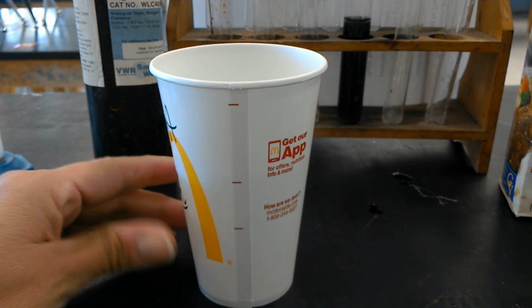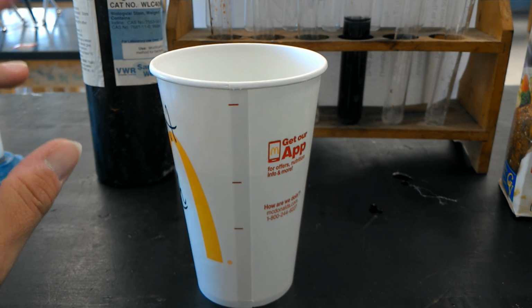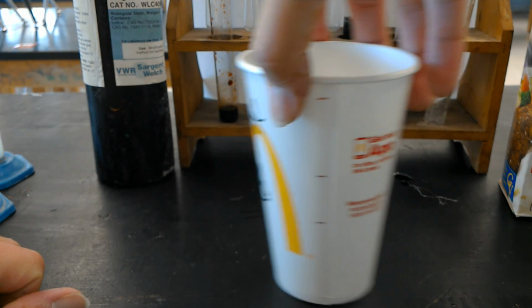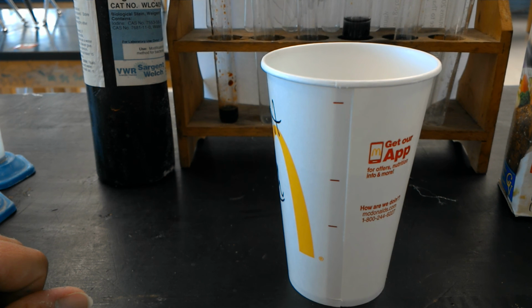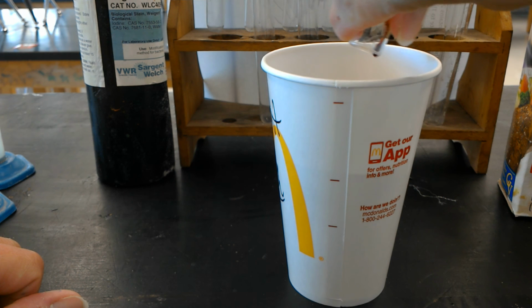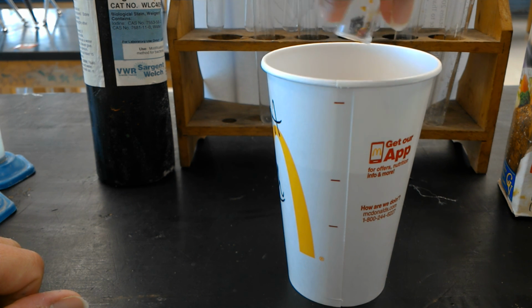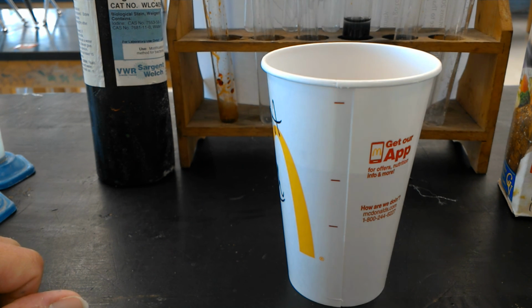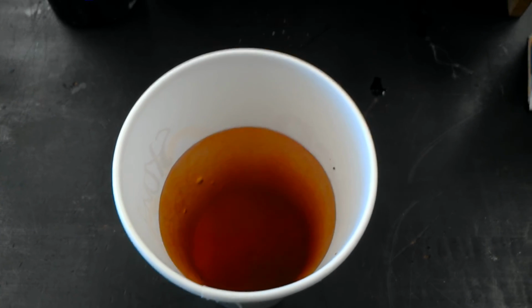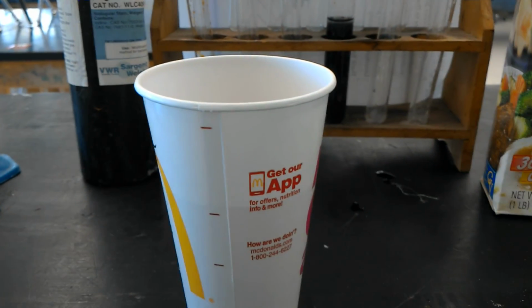And with this one, since it's not a real specific chemical reaction that we're looking for, it's okay to sort of eyeball this one. You will then get the test tube of iodine, and you will pour it straight into the cup. You do want to be careful because iodine can stain your clothes. Iodine is a poison as well, so just like any lab that we do in this class, you will not drink it. And so you can look in the cup and just see that that's not a pretty color. But that's our iodine solution.